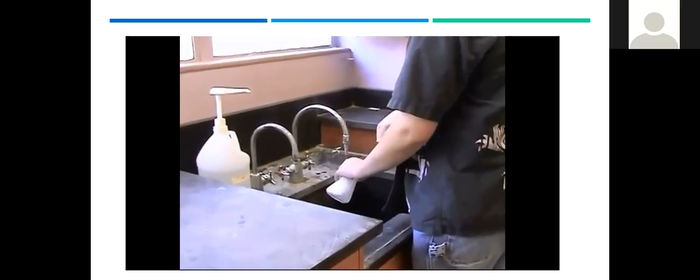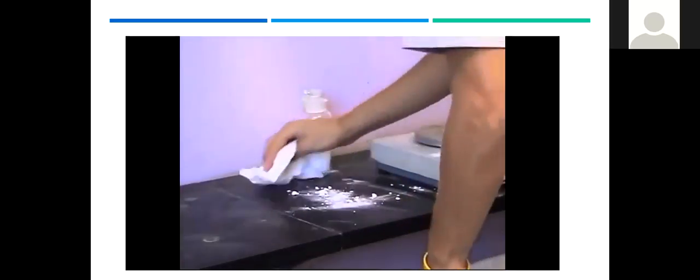After you have completed your experiments, return all items to their place. Wash all glassware, and wipe down your bench top before leaving the laboratory. Common areas, such as around the balances, must also be cleaned up. Remember, the single most important thing you must do in the lab is to wear your safety goggles.